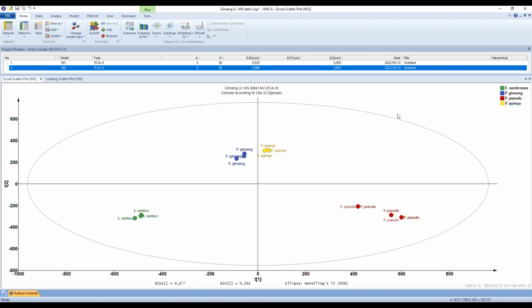It's important to go back to your raw data, to your original chromatogram, to see why that one sample is different from the rest. If nothing else is wrong, and it's just an outlier, depending on the research objective, if the objective is to just monitor variation in your data set, it's important to report that you will get situations where some of your samples have a chemistry that is completely different from the rest of your samples.